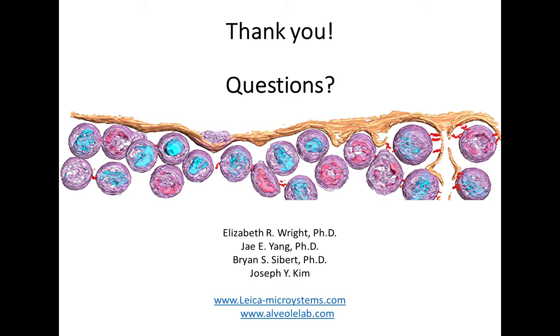So let's get started. Our first question coming in is for you, Liz. What difference does it make to use PRIMO to prepare my cell samples for cryo-ET? Thanks. This is an excellent question. So in using the PRIMO system to prepare cell samples for cryo-ET, we can really work well to ensure that the sample is well positioned in the center of the grid squares. So this facilitates data collection in the cryofluorescence microscope and under cryo-FIB milling or cryo-ET conditions.